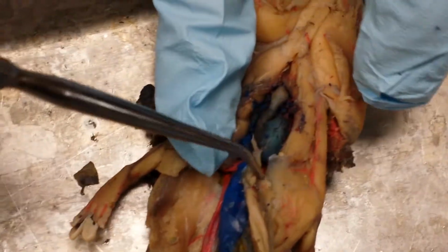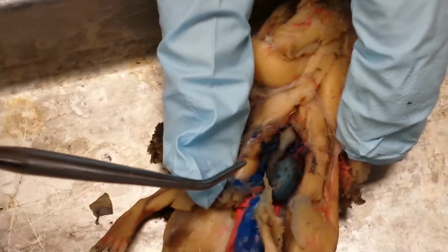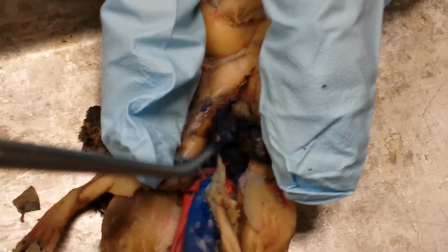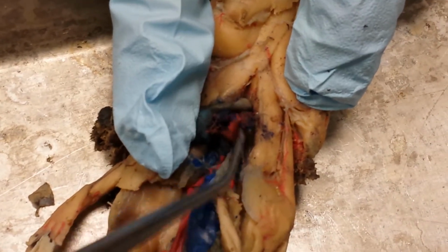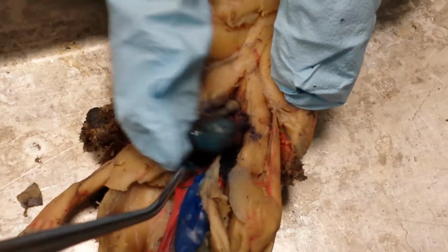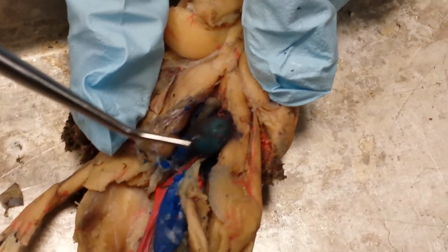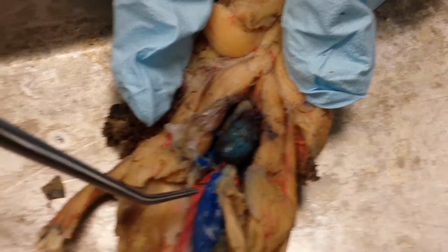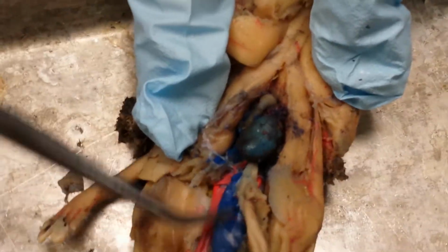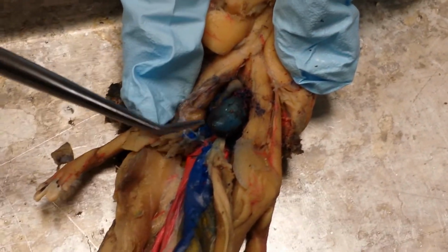The heart in the mud puppy has 3 chambers. It has 2 atria and 1 ventricle. Okay, so if you flip the heart this way and look underneath, you'll see there's your right ventricle. If you flip it over this way, it's the left ventricle. Okay? And that giant thing is the... or left atrium, sorry. Right atrium and left atrium. This big thing is the ventricle. Okay? So, sinus... Yes, it looks like a jelly bean. Gross. All right. So, post cava, sinus venosus, right atrium, ventricle.